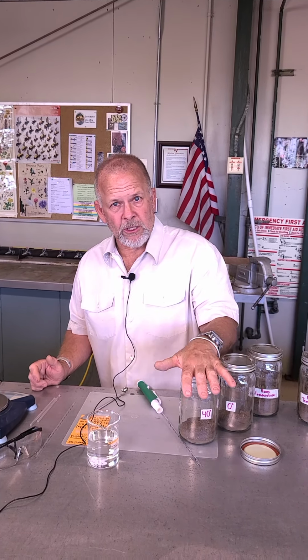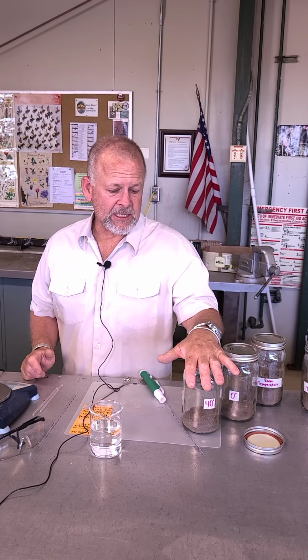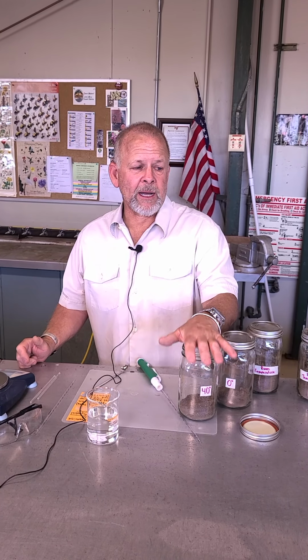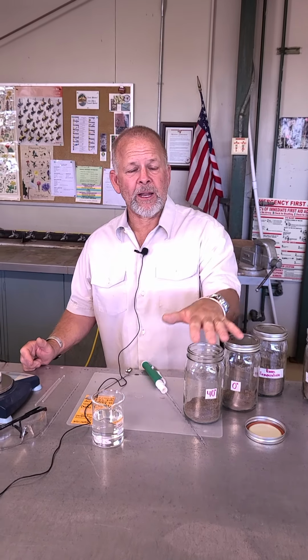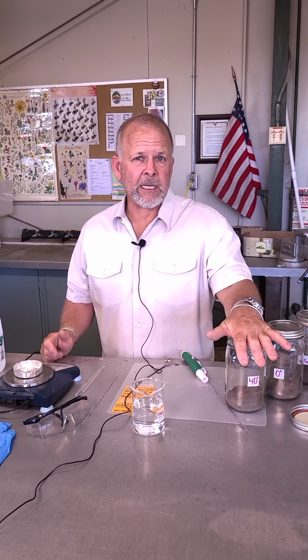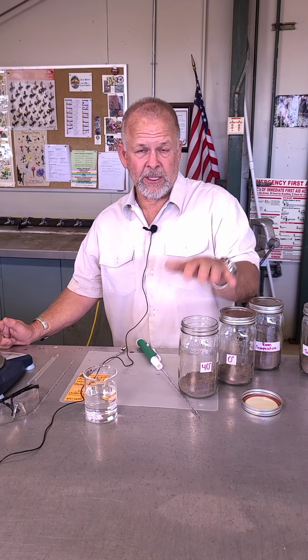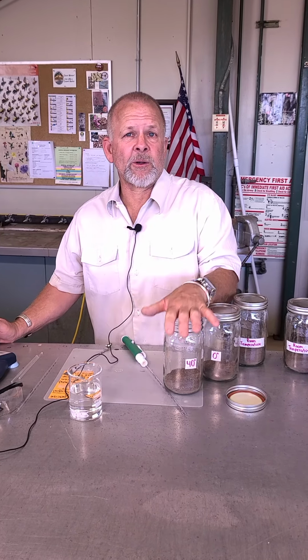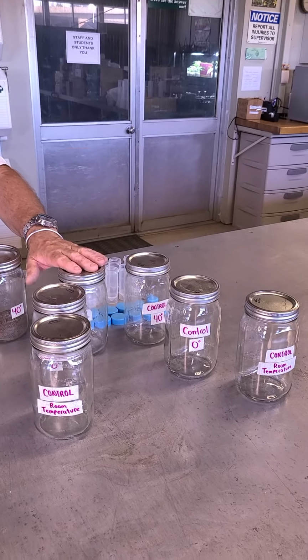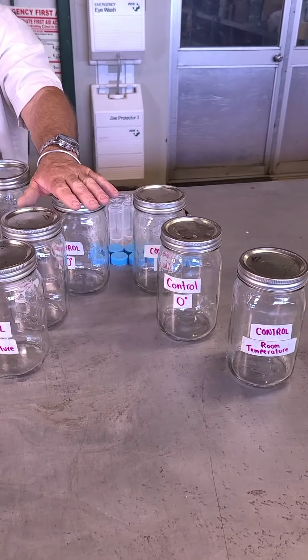So we can make sure that no carbon dioxide that gets generated in these little worlds gets a chance to escape. But for us to really be able to compare what's going on, we have to have some worlds that don't have any soil in them. If we have an error, or we can generate some carbon dioxide because it's in the air, or maybe it's inside because there's something inside these jars, it's our source of error. So that's what these blank jars, these empty jars over here, are. They're still labeled, but they're not going to have any soil in them.